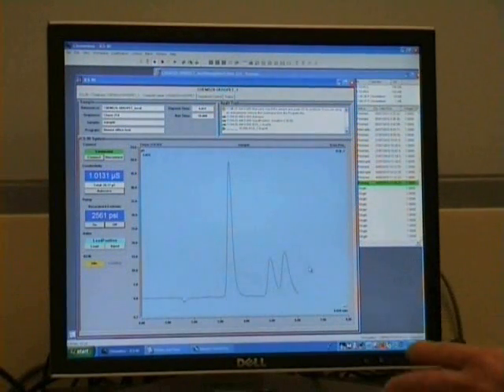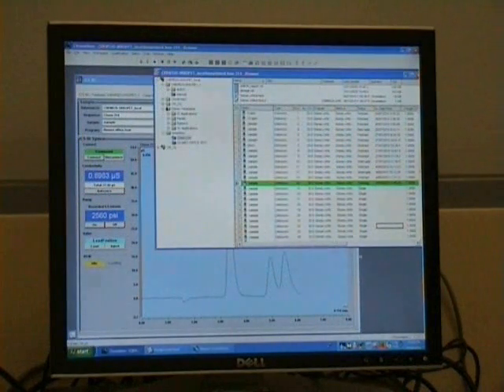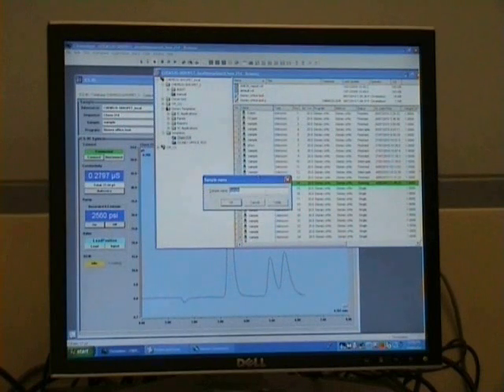While the sample is running, which may take five or ten minutes, you can click back to the recording spreadsheet. Here you can go to a previously finished sample and name it so you have a record of the samples you've tested. To do this, click on the sample and hit F8, and it will bring up a pop-up bar where you can name your sample.